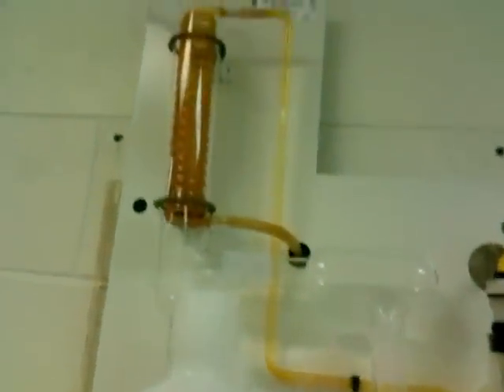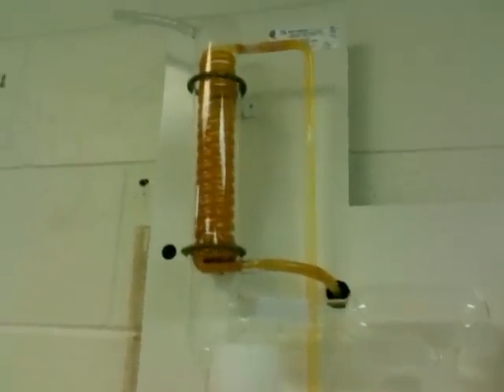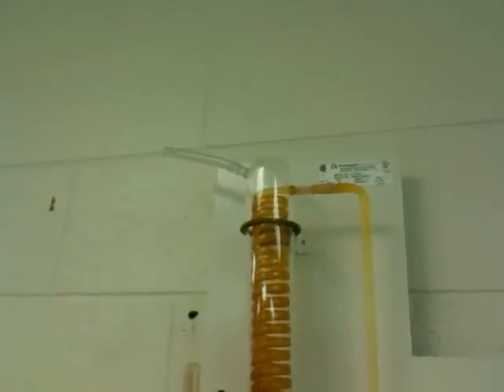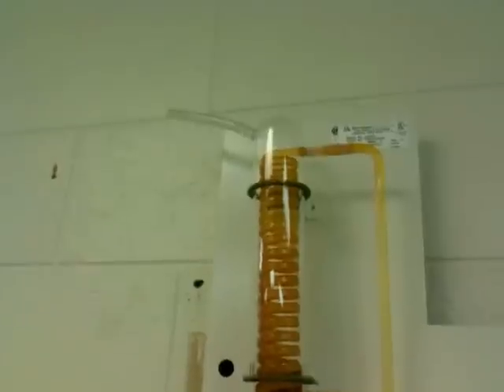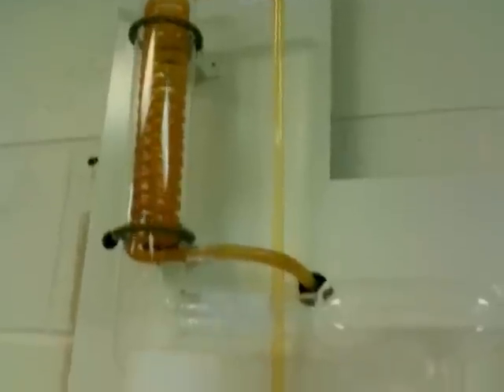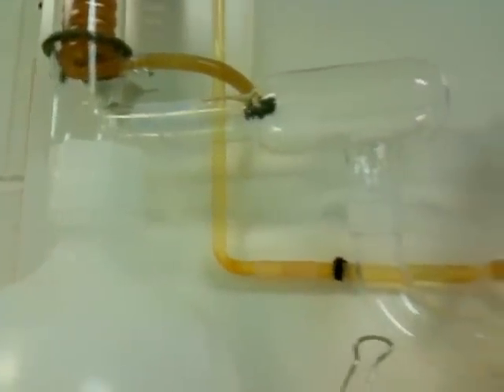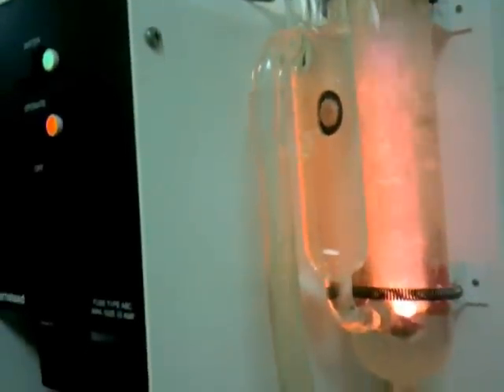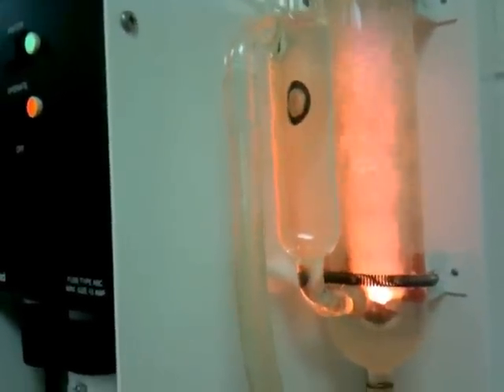The cold water comes up through this brown tubing, up through the coil, and then simply comes out the top of the coil. At the top of the coil it's a little bit warmer, because energy is being transferred from the steam into the water. Then that water comes down and over, and mixes back into the system so that it can start boiling again.